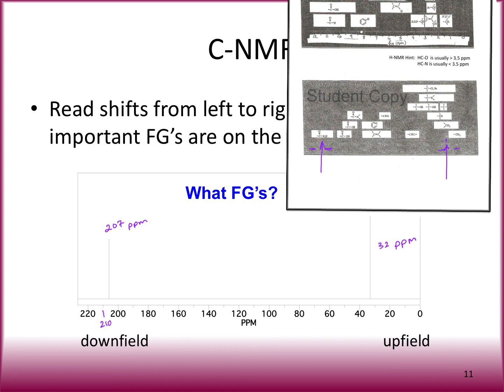So if we look on the left, that's pretty easy. It's got a carbon double bond O with either an R group or a carbon double bond O with a hydrogen. They just are abbreviating and trying to put them together. So this means it's either going to be a ketone or an aldehyde. That's what that means, okay?